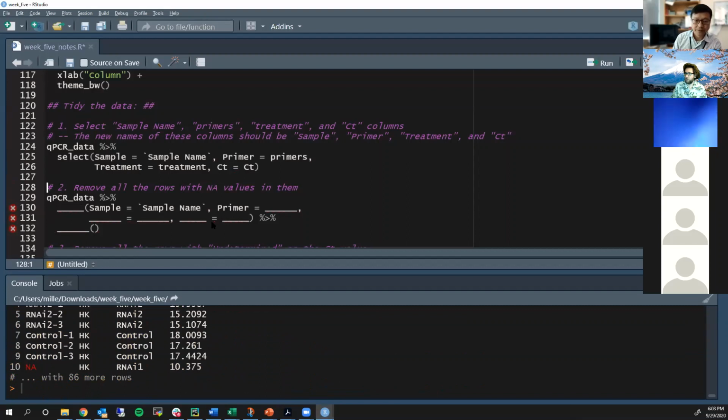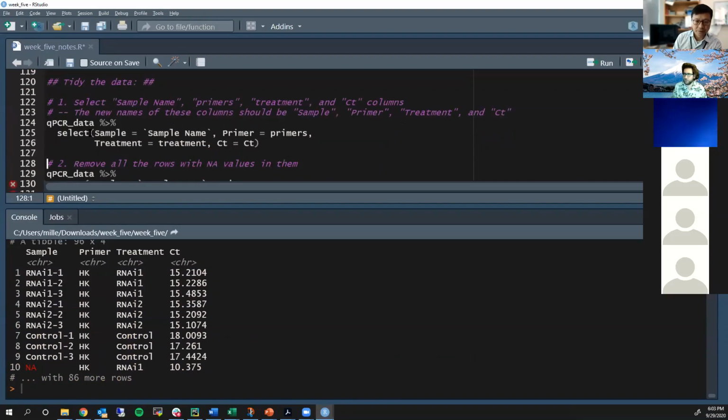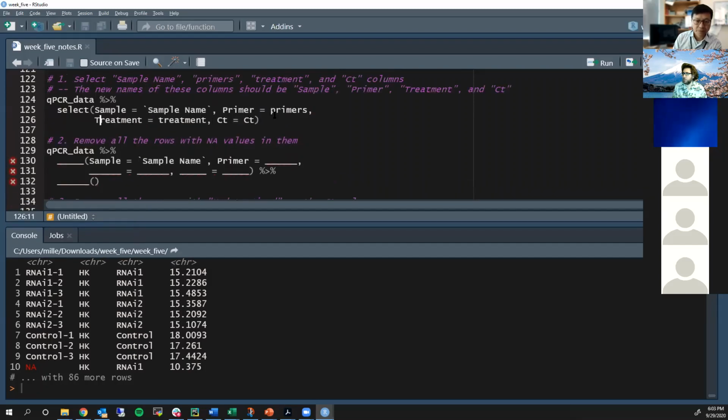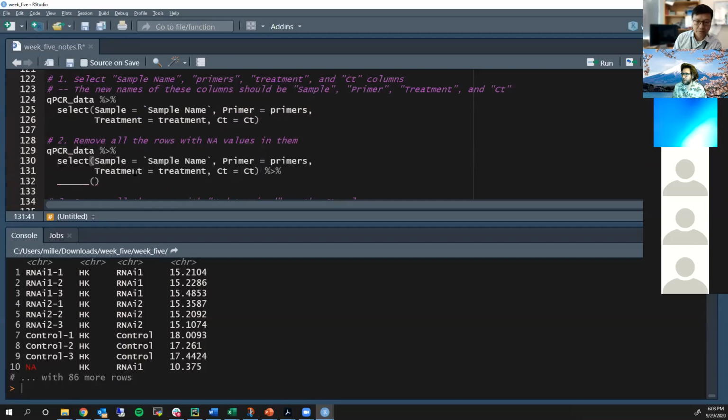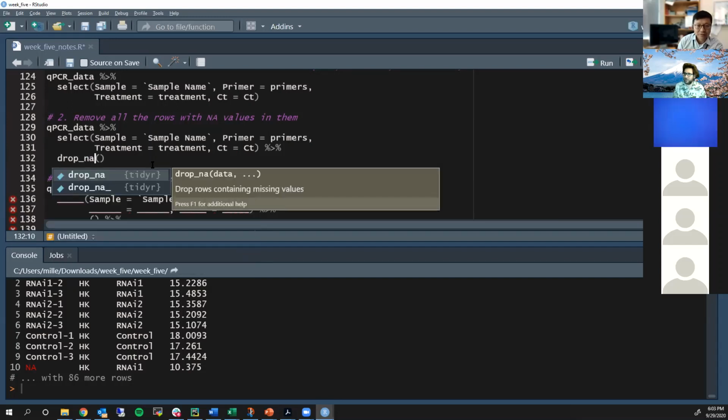All right, so when we run this, we get our 4 columns just like we intended, with the correct names associated. All right, so we can just kind of copy and paste as we go along. Copy and paste is a great skill to have as a programmer. Can anyone tell me what the verb we use here is to remove the rows with NA values? Yep. Yeah, Kevin got it. Drop NA. Yep, Aola got it. Simon got it. Okay, perfect.